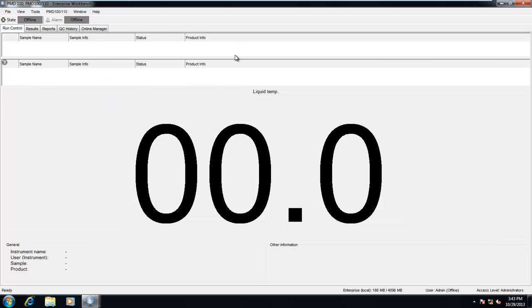Run control displays our real-time data. The data displayed here will change depending on the instrument type and may report temperature at different locations depending on the application. For instance, a freeze point analyzer may display both temperature at the sample temperature probe and at the jacket itself, while this PMD will report temperature at the vapor temperature probe only. This window will also display relevant user and sample data, such as who is running the test, the sample name, the current date and time, and the product or method being used.